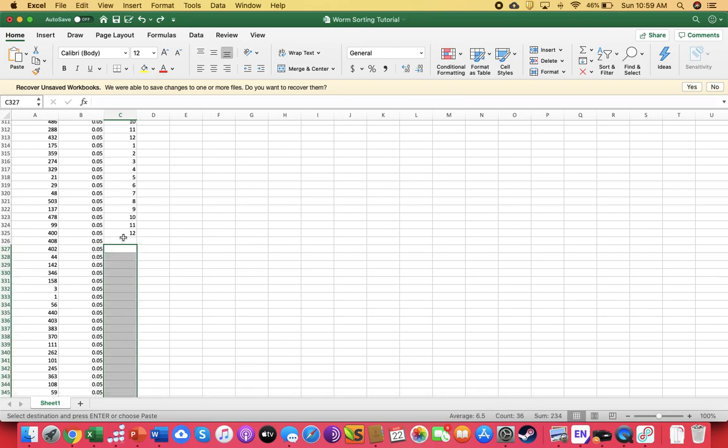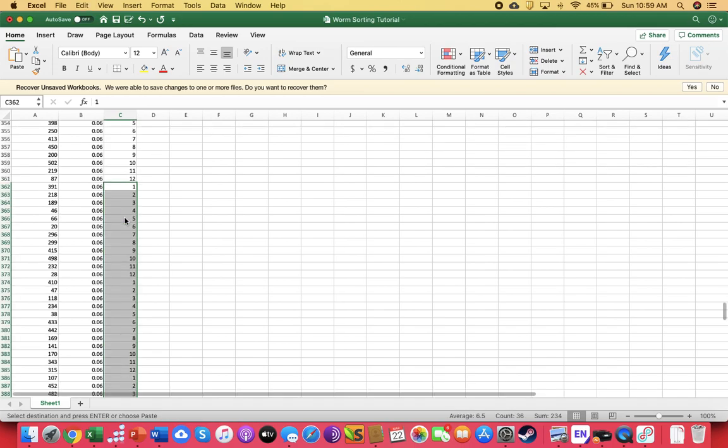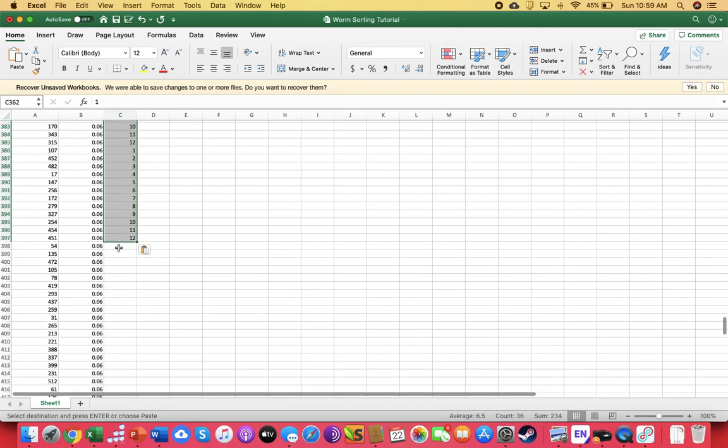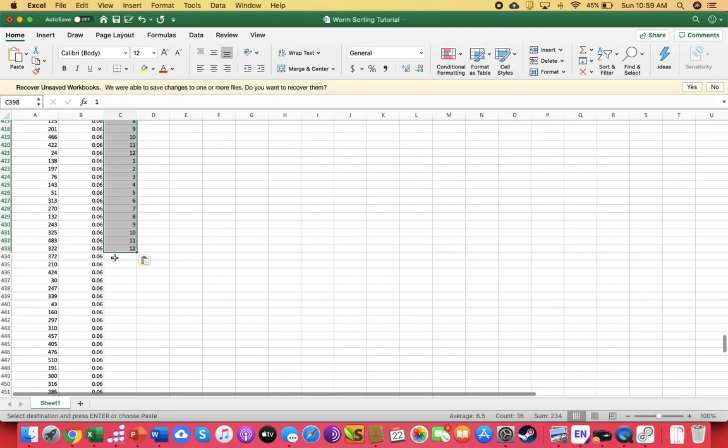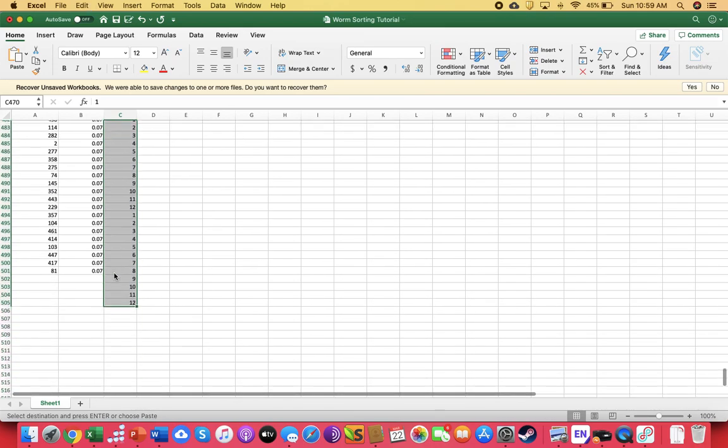But oops, don't want to do that. Okay, so now all I'm doing is copying and pasting 1 through 12 multiple times here so that I'm giving each worm a tank number.